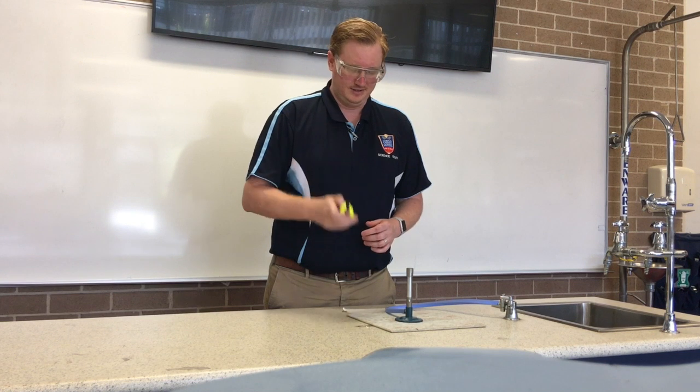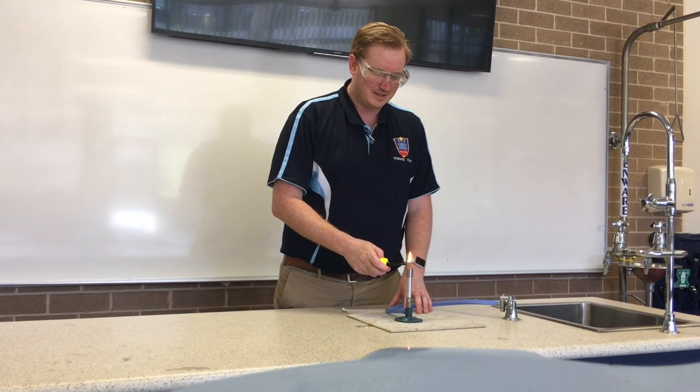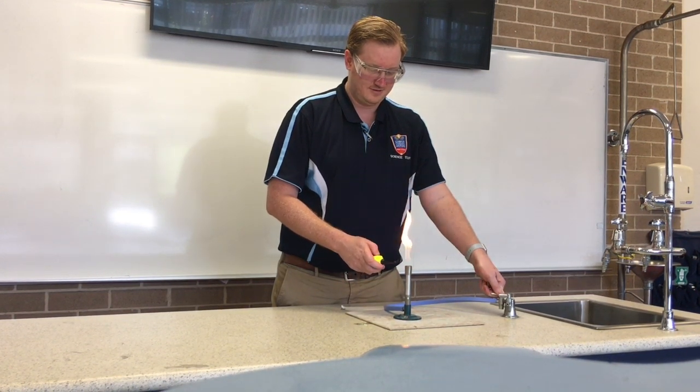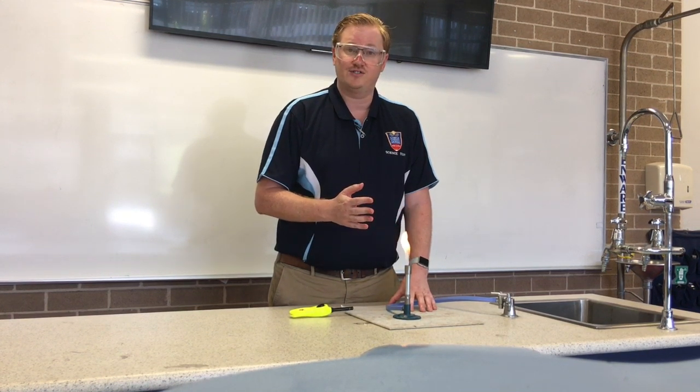From there you're going to take the lighter, make sure it lights, hold it over the Bunsen burner and turn on the gas tap. The Bunsen burner is now lit and it has a bright orange flame.